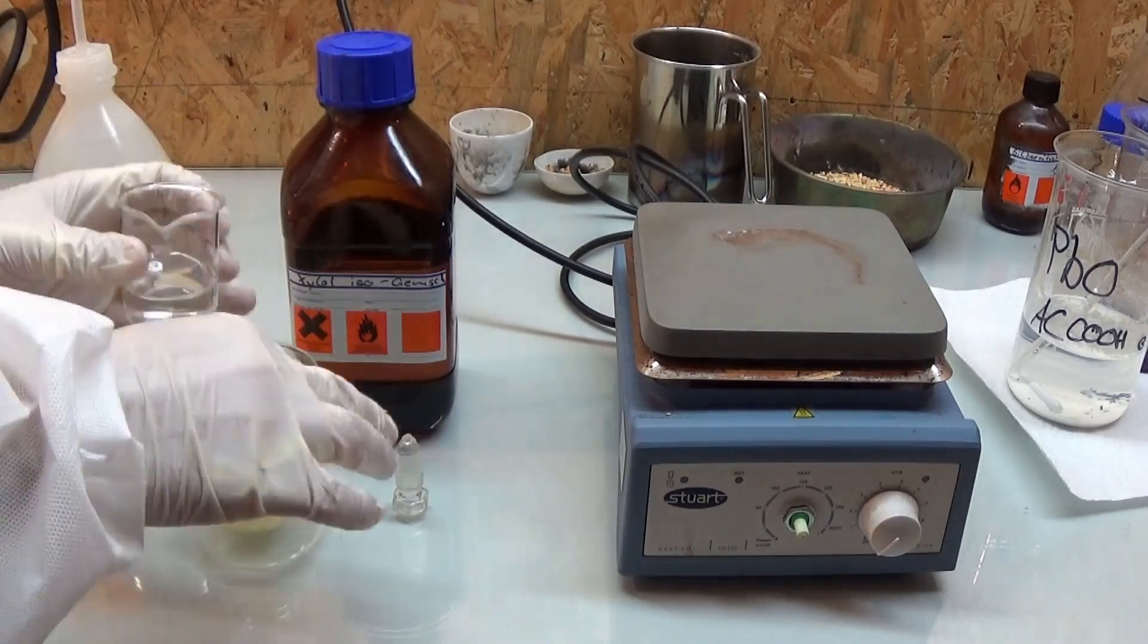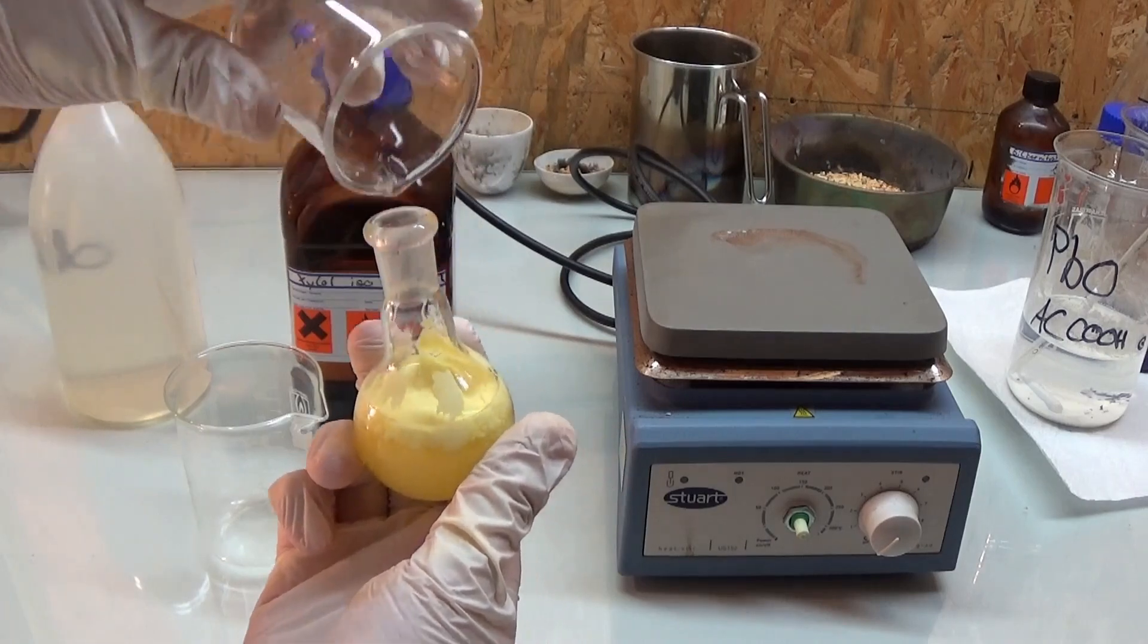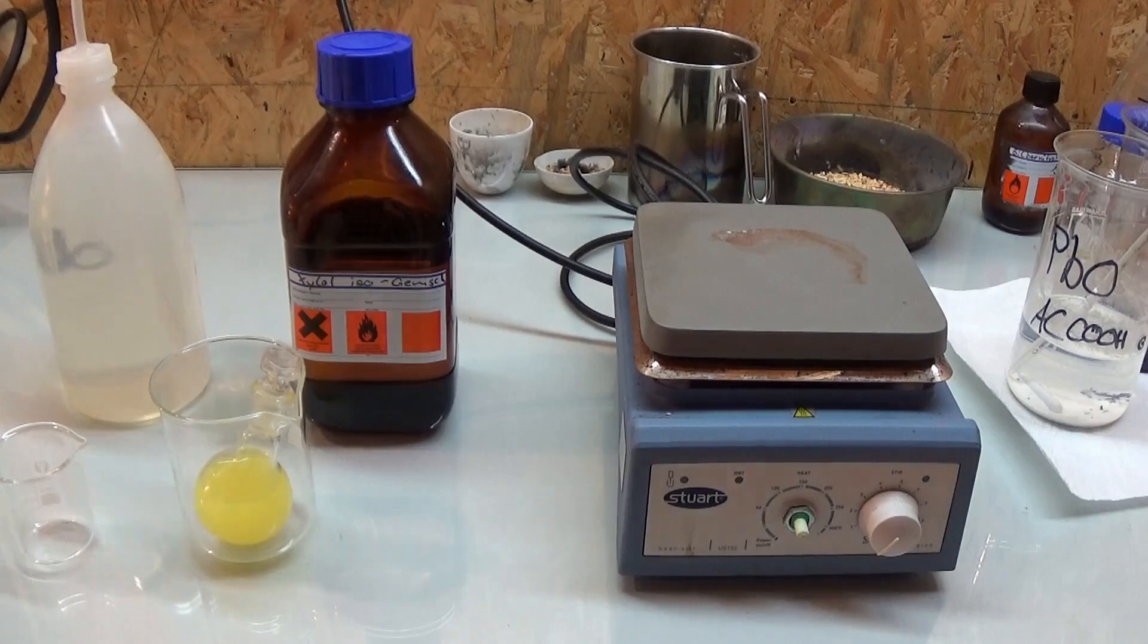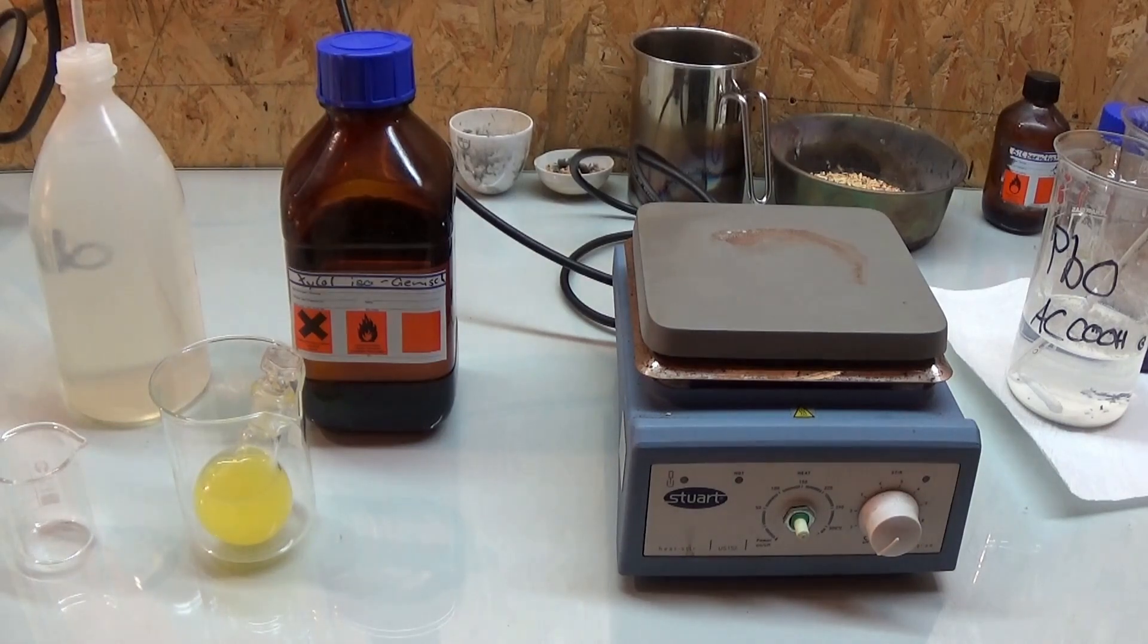To work up the reaction mixture we add some water to dissolve all polar hydrocarbons and the sodium hydroxide. This mixture is then extracted using 25 milliliters of xylene. This extraction is performed twice.